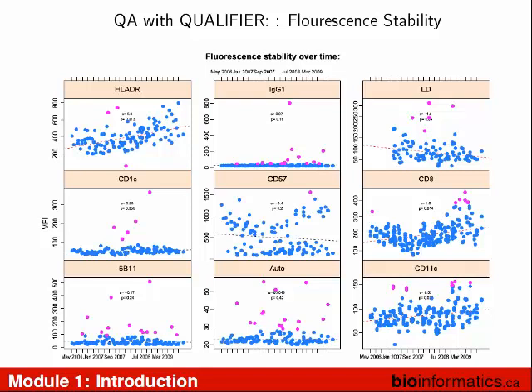One of the problems with doing quality checking is there are no expectations at all. If you have an expectation, you can probably write a statistical test for it, because an expectation means you have some idea of a distribution. If you have an idea of a distribution, you can check your values against that distribution, and that's how you get p-values. With all this stuff, you have no expectations, because if you did, you would have a hypothesis, and if you had a hypothesis, you could test it, with a t-test or something. There are no t-tests. Essentially, there is a bit of that going on here, because that's how we figure out what's red. But a lot of it is just visualization of your data, big data exploration to try and find things that look wrong, generally.